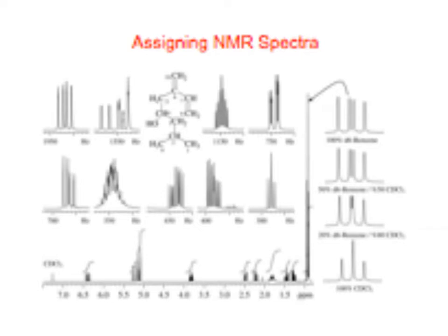1 and 9. Okay, where are we going to assign those? At 750? Sorry, 750 hertz? Yep, the one on the top right. Well, no. So the ones in the expansions go in order. So this one here is this doublet of doublets. This packet here is this. This one is this. This one is this. 2.5. So the question is, are 1 and 9 equivalent?